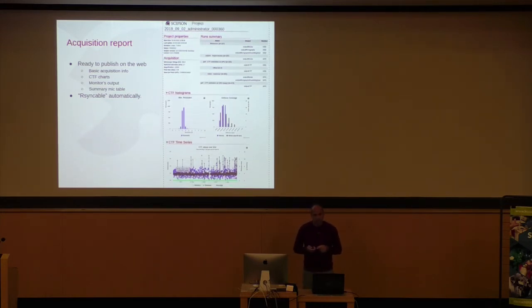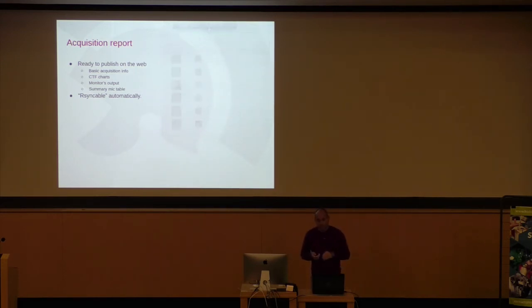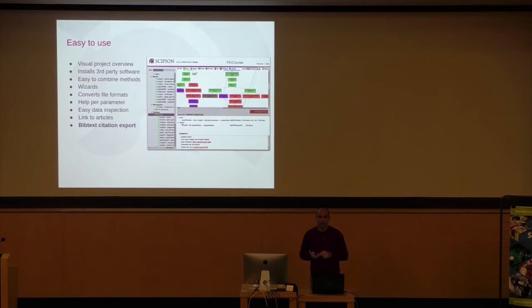And then you can have a table of the micrographs with the CTF and snapshots or thumbnails of the micrograph. So you can see how the acquisition is going on.